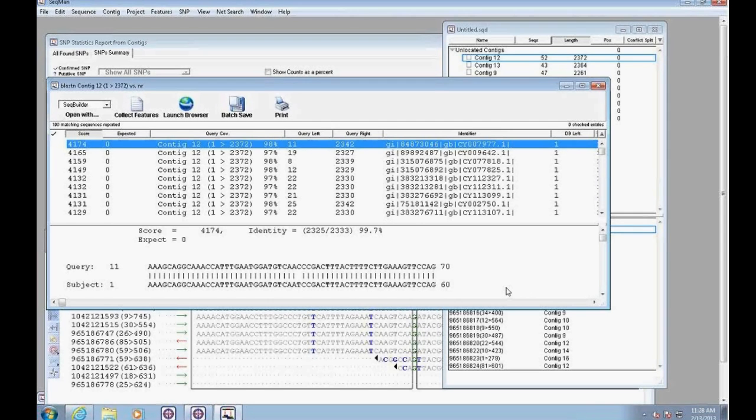And your analysis will be performed in this program, SeqMan Pro. So Sanger sequence is just one of the many workflows that we support in SeqMan Pro. So you can definitely work with all major next-gen sequencing data technologies, such as Illumina, 454, Ion Torrent, and PacBio.